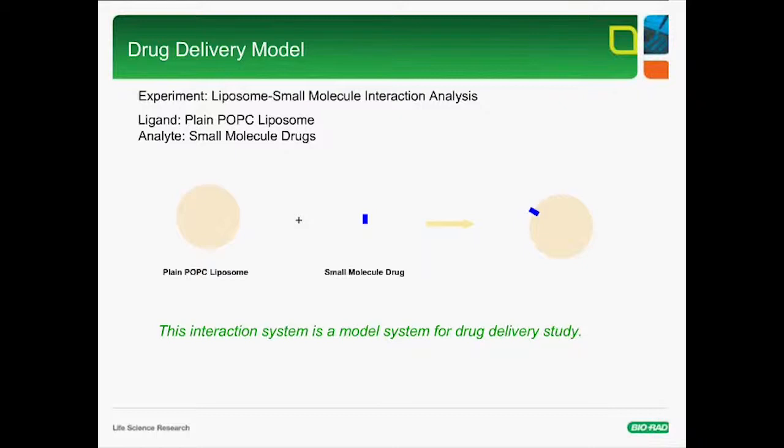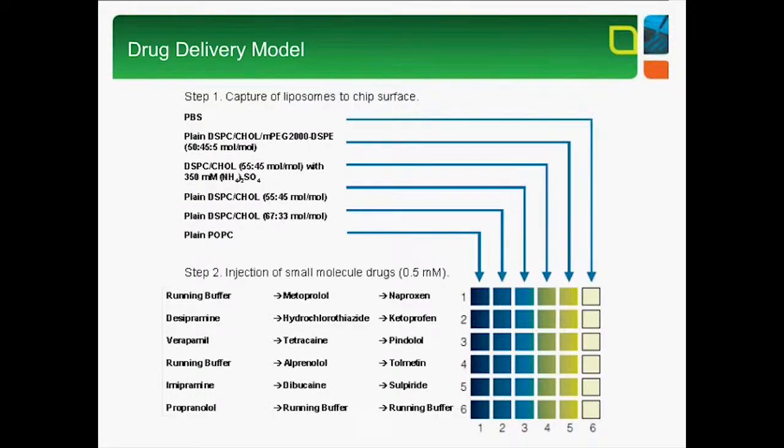using the links provided. So in the experiment design, we immobilized different liposomes in the vertical channels and injected the small molecule drugs in the horizontal channels. So this is a high throughput manner to analyze the interactions between the small molecules and the liposomes.